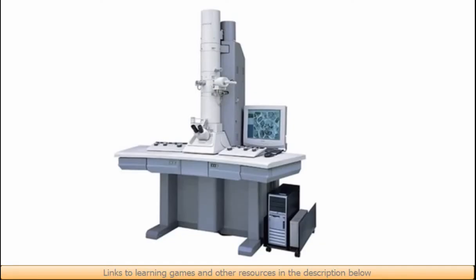An electron microscope uses powerful magnets to focus an electron beam, in a similar way that light microscopes use glass lenses. Electron beams have a much shorter wavelength than beams of light, so the probing beam can fit between spaces that a light beam wouldn't be able to, and that leads to a far better resolving power.